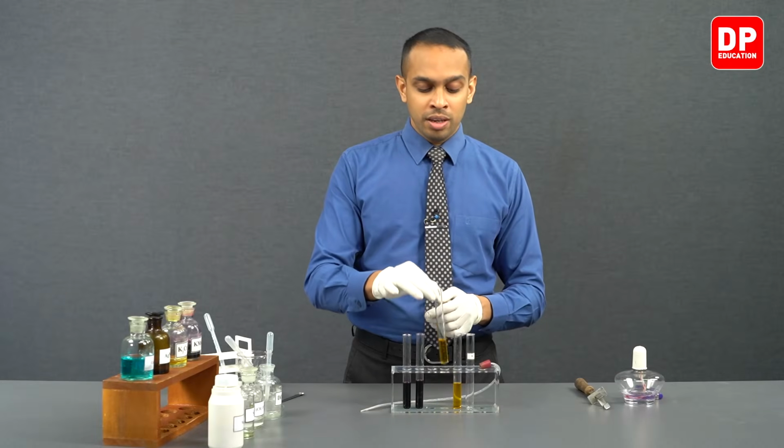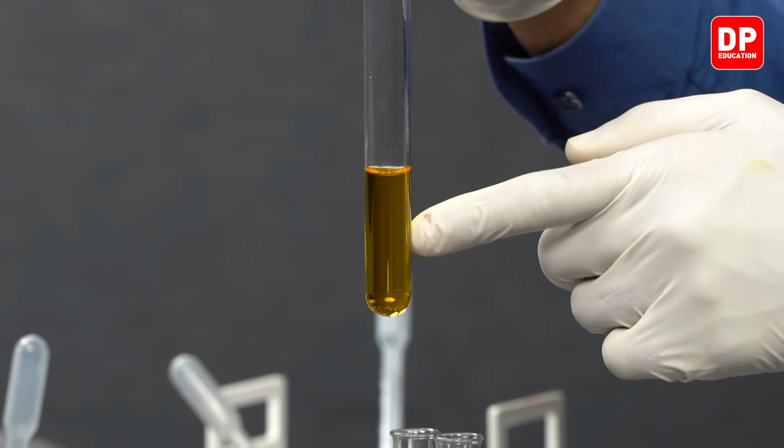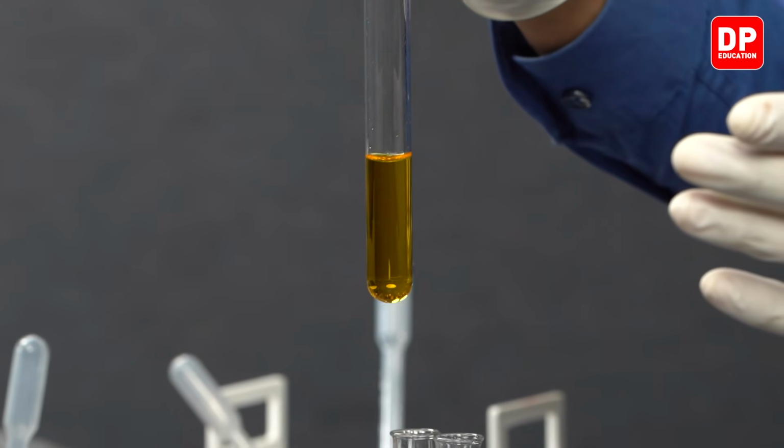As this color change happens, you will observe that hydrogen sulfide actually gets oxidized to form sulfur. It is getting formed in the form of colloidal sulfur. So you will observe that the solution is becoming milky. So the orange color turns to a green color, as well as the solution turns milky.